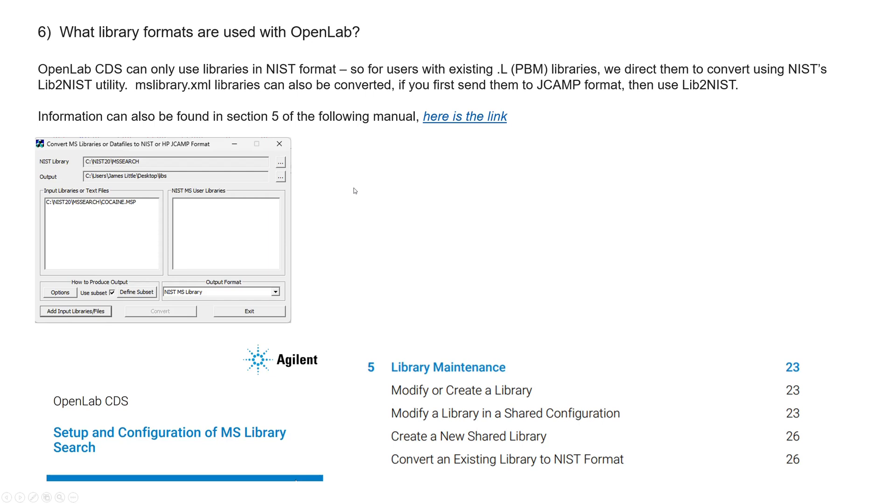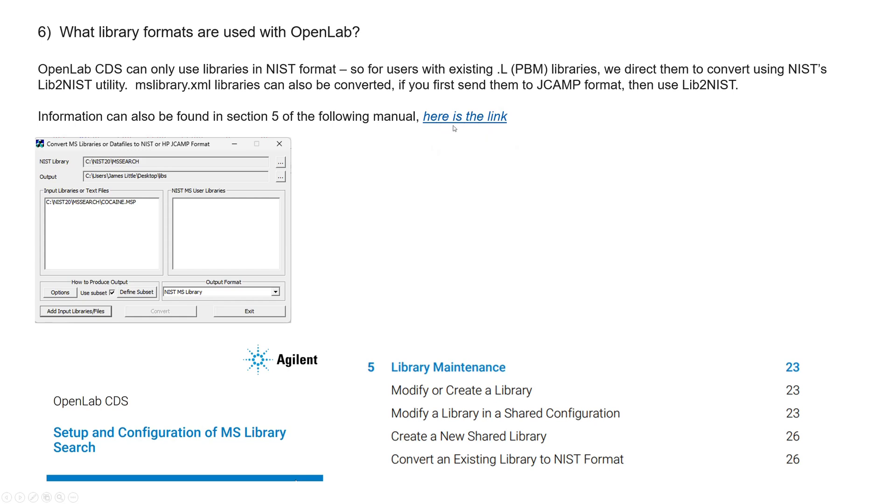What library formats are used with OpenLab? Well, they use the NIST format. So if you had a .L or some other format, Jcamp, etc., you would have to use the NIST lib to NIST utility. I've shown a screen capture of it to convert it to the NIST format. And I put a link here to get to some more information about that.